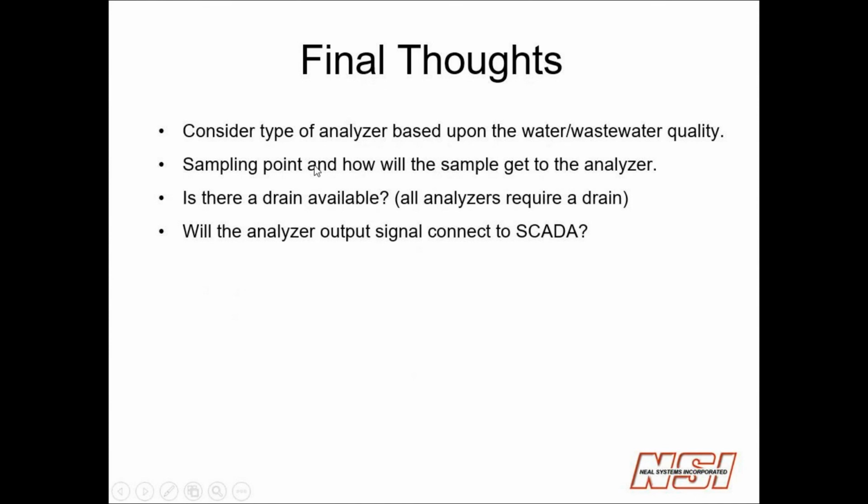Will the analyzer output a signal to your SCADA, and where are you going to tie? If you're going to tie it into the SCADA, where are you going to connect? There should be an I/O, an input-output panel somewhere in your plant where you can tie that into your SCADA.